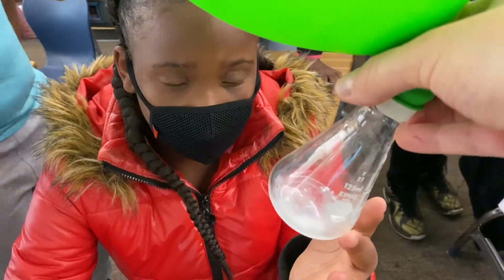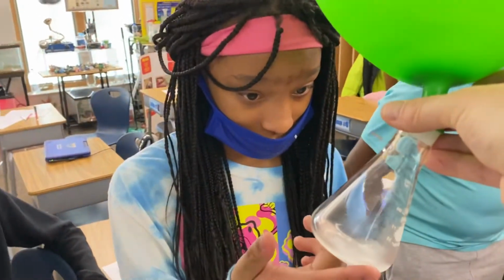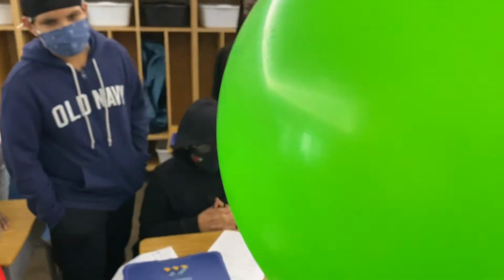See that? Okay, now touch the flask. Is it cold? It should be really cold. Jemiah, touch the flask. Isn't that crazy? Okay, now Denijah, there's still a piece of dry ice in there. Do you see it? Yeah. Feel it. Denijah, is it cold? And look at our balloon, it's fully inflated.